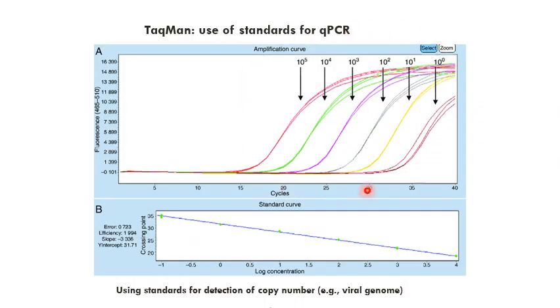So here again, if we want to see the amount of DNA, you can see the least cycles have the more amount of DNA. If we compare 15 to 30, for example, here it has more DNA compared to these at the end. And when you see that the curve is going closer to the threshold, it means this is the least amount of DNA you have.